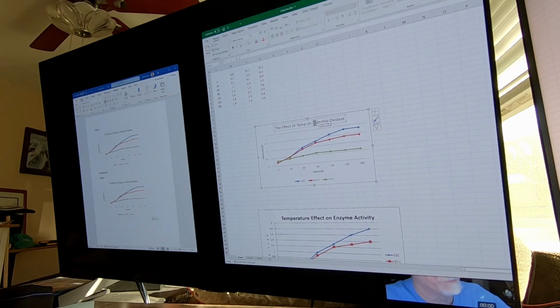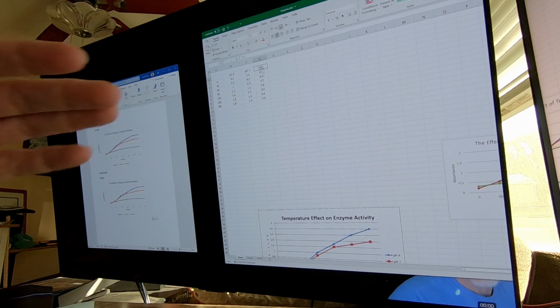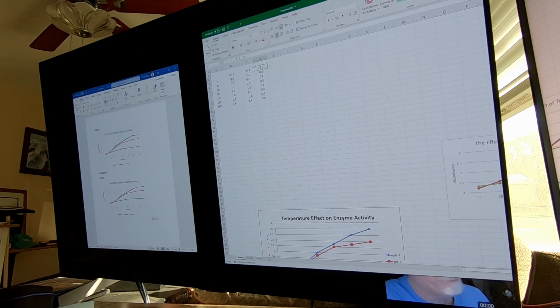You just pick it up, set it aside, and then change whenever we had a pH. It's little p, big H, 4, and then we had what? Little p, big H, 7, change that, and then make that pH 8.